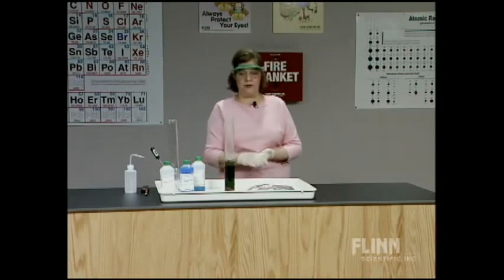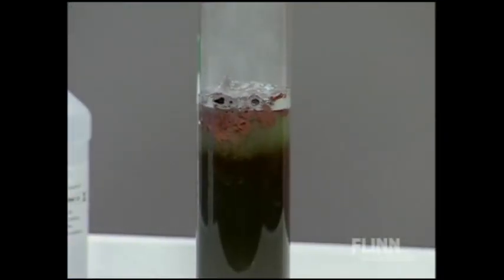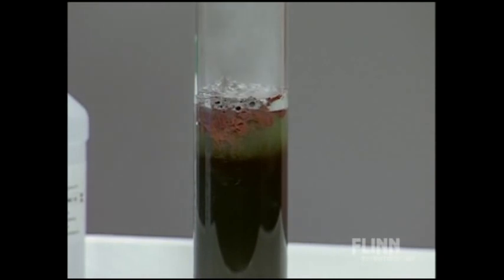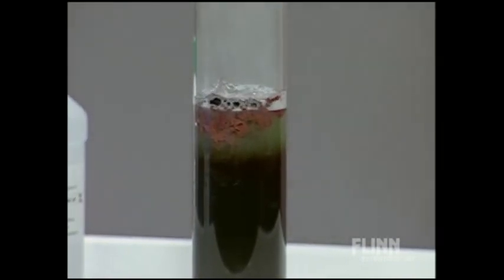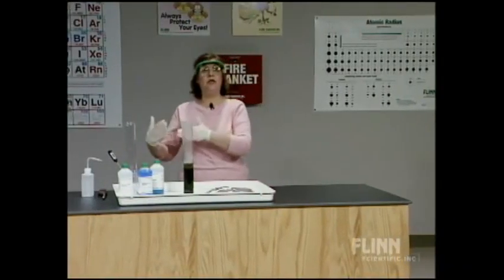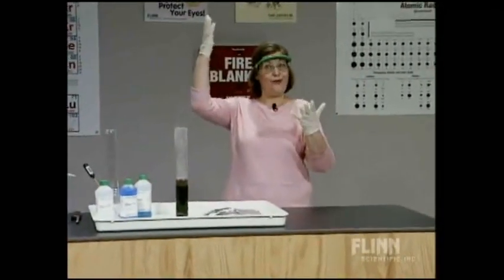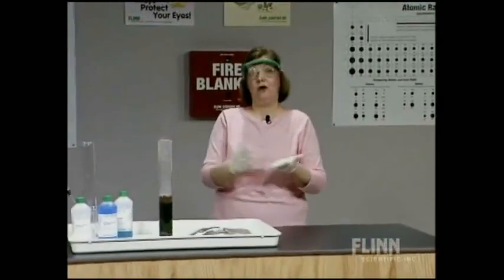So what else could it be? And they think for a little bit, and you go, well, what did we start with? We started with copper 2 ions and aluminum foil. So what might be reddish brown, almost kind of a coppery color? And you can almost see, this is a great one, again, a great first demonstration or first experiment for students, because the observations themselves are the clues that lead them to understand the chemistry. And they go, reddish brown, copper. You can see the light bulb go off in their heads that they've figured it out all on their own.